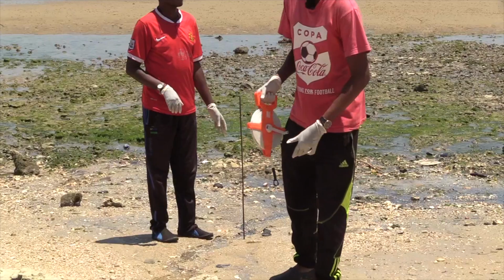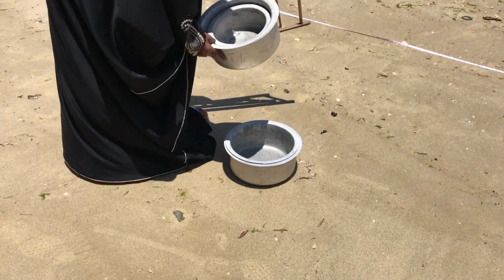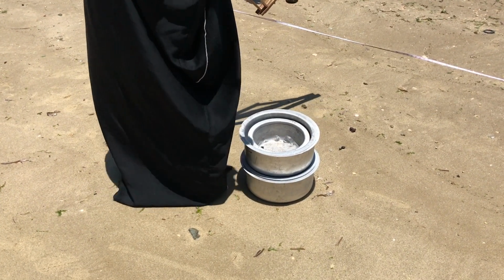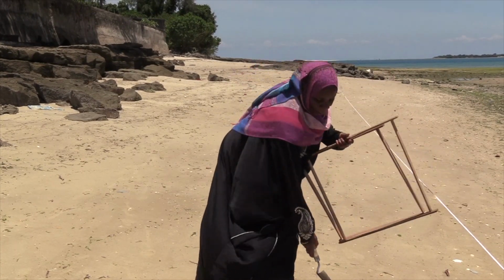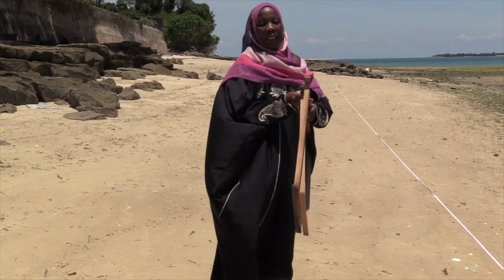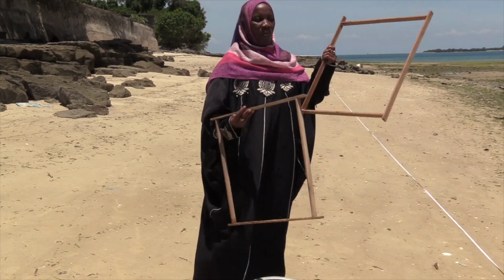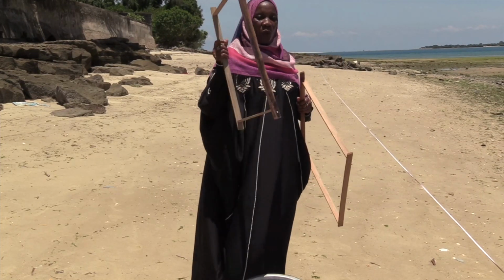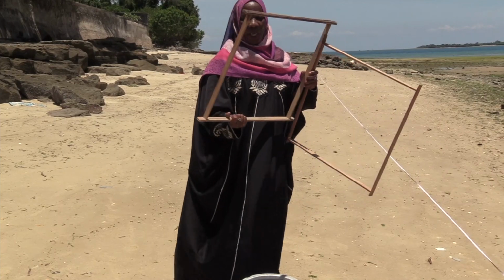First of all, we should have a tape measure or field tape, and we should have basins, that are aluminum or metal ones, about 5 basins. We have the shovel, also aluminum, and we have the quadrant, the square quadrant. This should be a metal one or a wooden one, not plastic. Through this quadrant, we are going to do the sampling for microplastic.